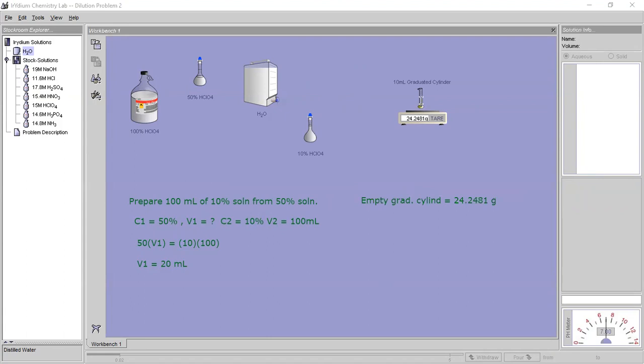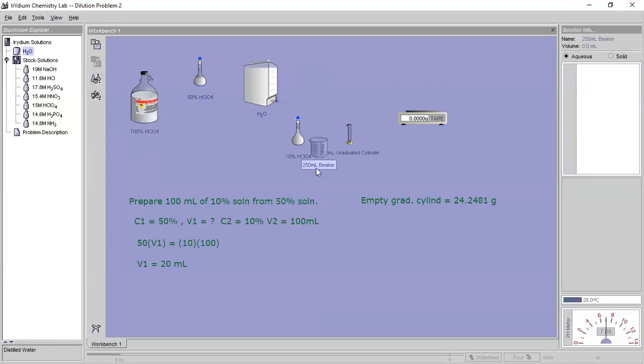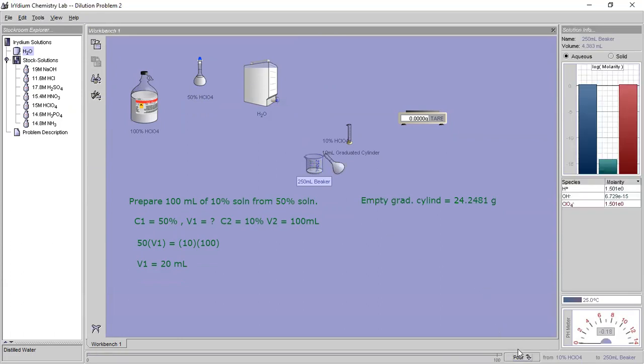Now we need to add 10 milliliters of our solution to the graduated cylinder. Now again, here, if you go over, you can take some out. If you're a little bit under, you can use that as well, as long as you record the volume that you use. Now, one thing to bear in mind is that since we made a less concentrated solution of the perchloric acid, our density should be less than the 50%. If it's not less than the 50%, we've done something wrong.